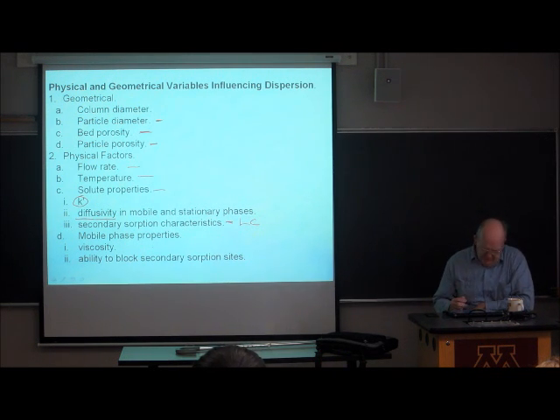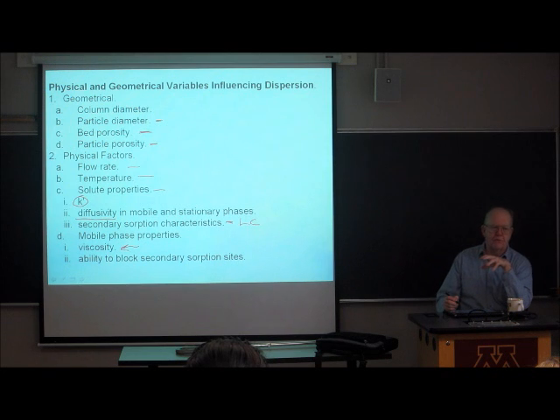Various properties of the mobile phase are very important. The viscosity of the mobile phase is super important. The viscosity is what differentiates gas chromatography from liquid chromatography, and hugely impacts how we actually build our instruments.